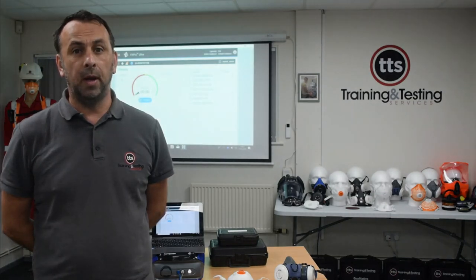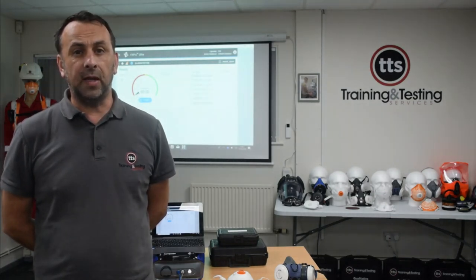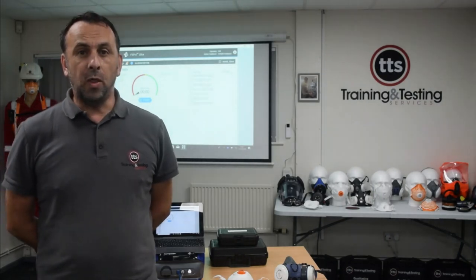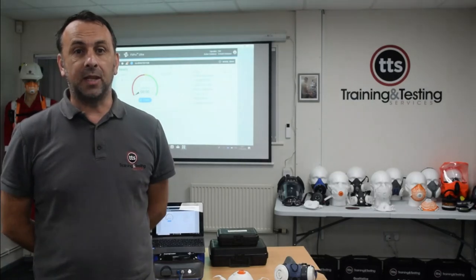The idea of this video today is to demonstrate to you the effects that facial hair has on tight-fitting respiratory protective equipment. In particular, we're going to look at the effects that it has on disposable half-mask respirators and also reusable half-mask respirators. For the benefit of this video, I've spent the past 7 days growing facial hair. I hate not being clean shaven, but I think I'm rocking the vagrant look pretty well right now, okay?